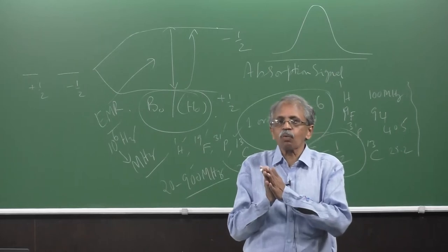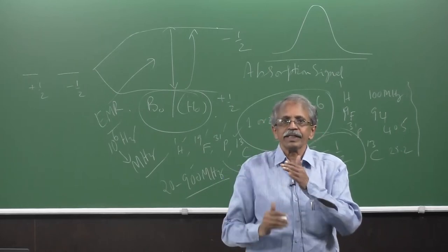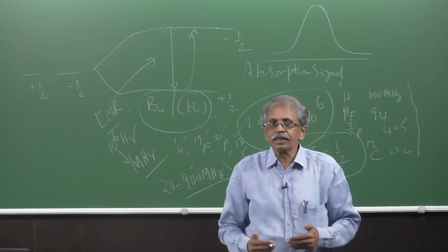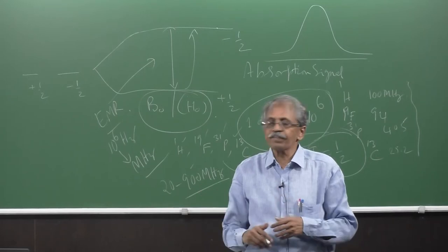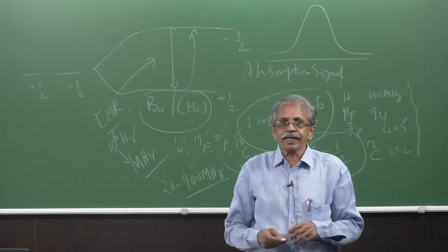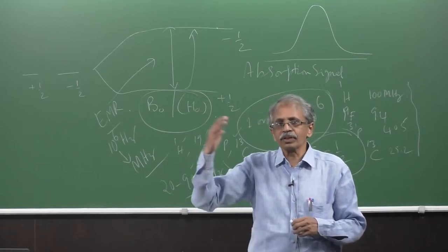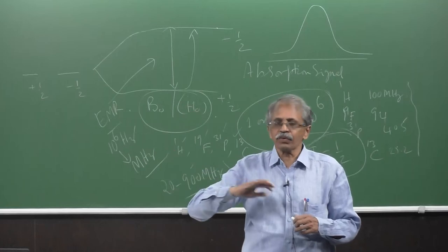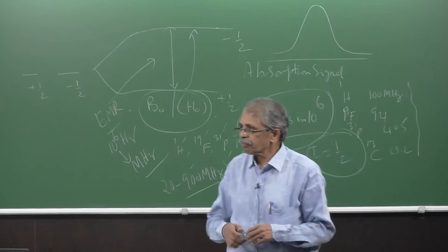And what you need is to bring the population to absorb external energy, which is in the megahertz region, called radio frequency. So, in the radio frequency, it will absorb and then get excited. And then that absorption signal is what you are measuring. Of course, there are relaxation processes, which we are not going into the details of. And that's why the process continues.